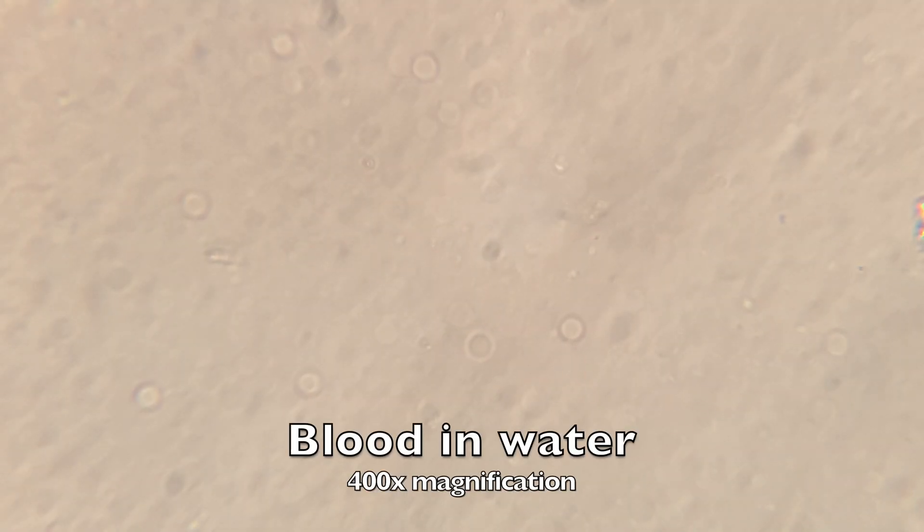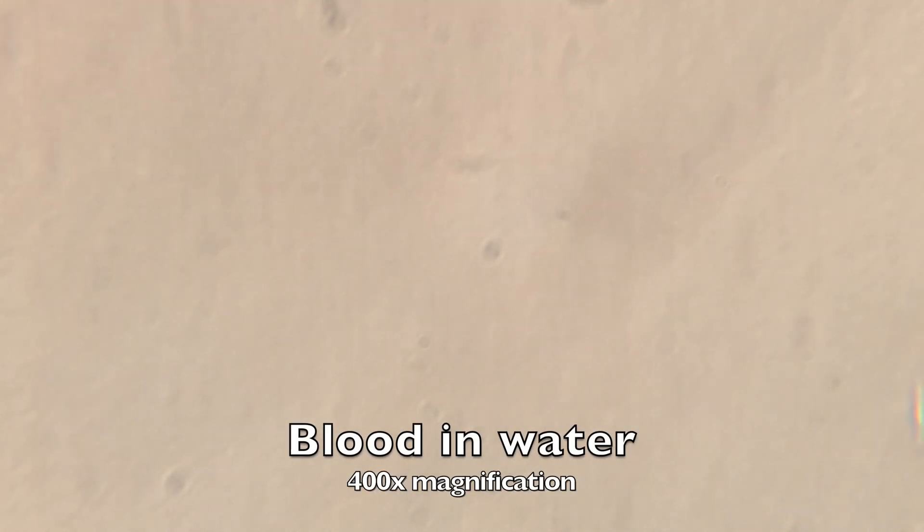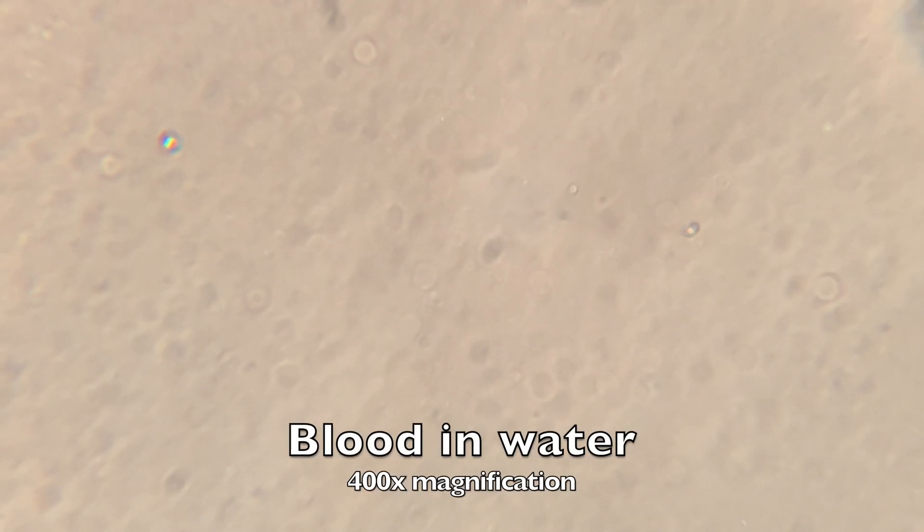Now conversely I wanted to show what it would look like with just plain water, because everyone thinks that water is great, right? But there could be a time where too much water could be dangerous. When I added the plain water, a lot of the blood cells actually popped. You can still see a few of them left but they are very big and very swollen.